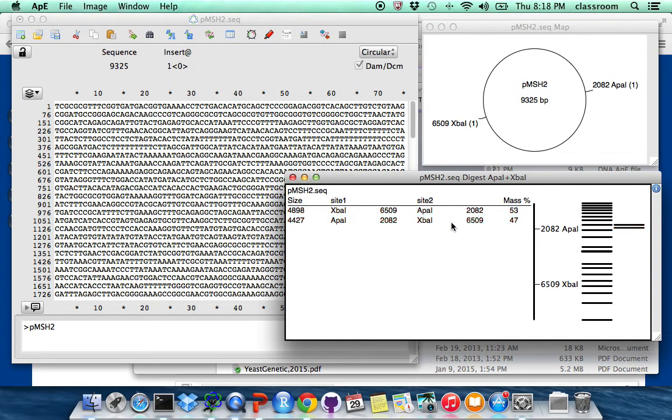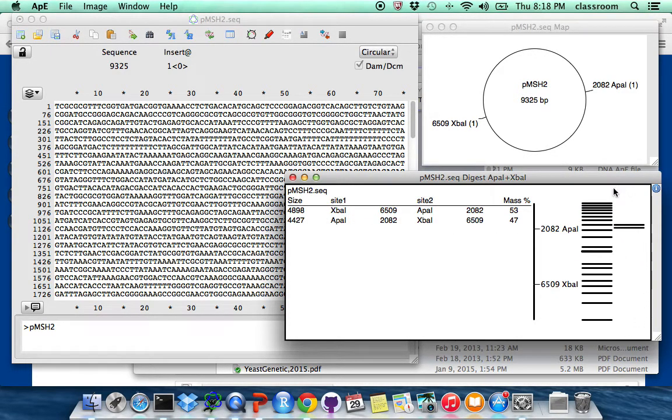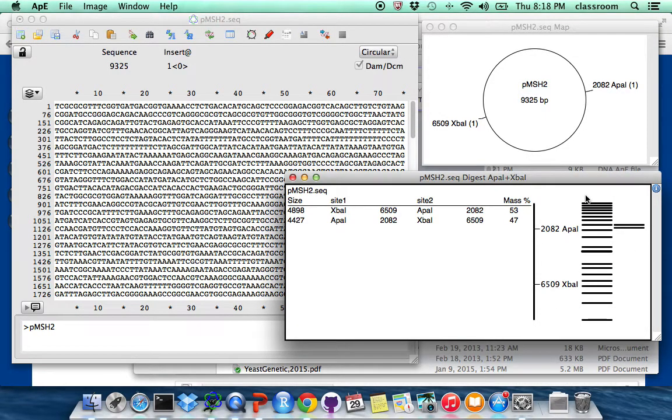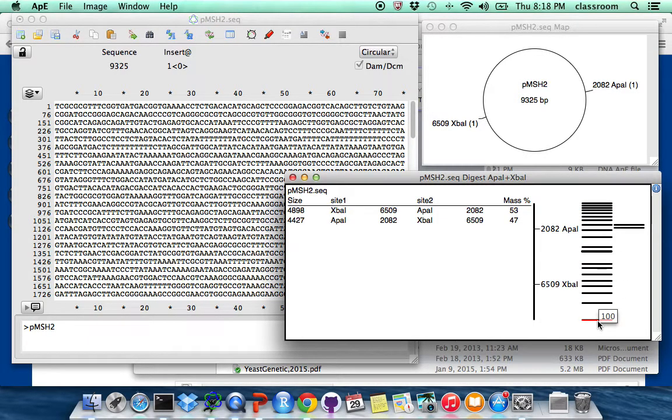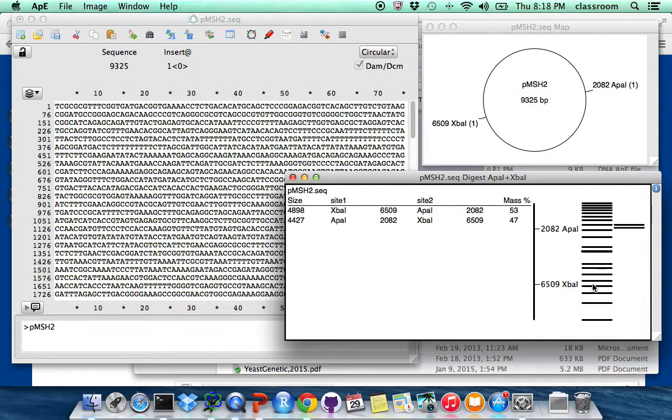But when we run them on the gel, so on the right hand side here, this is a simulated agarose gel running. And those are the letters, size letters, so bottom is 100 base pair, 200, 300, 400, what's this? 1650, 2000.